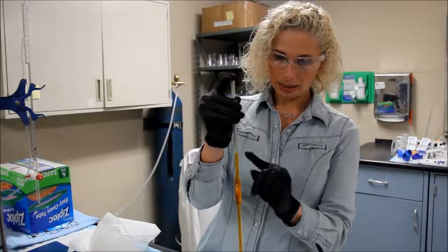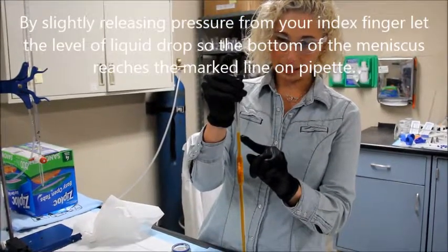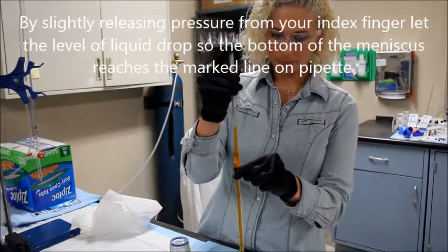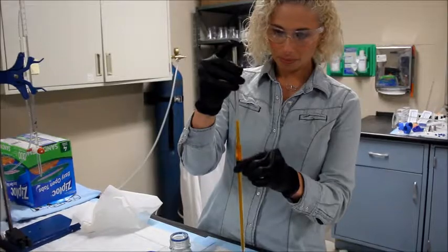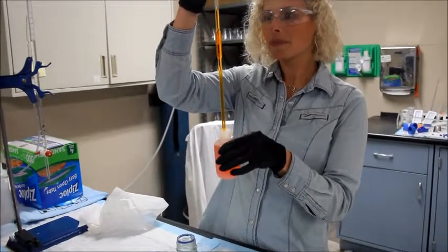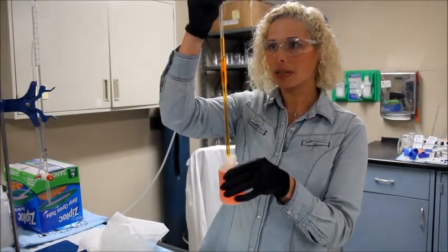You will now let the level of the liquid drop to the meniscus line, which is hard to see on the camera but clearly visible in person. I like to bring this up to eye level.